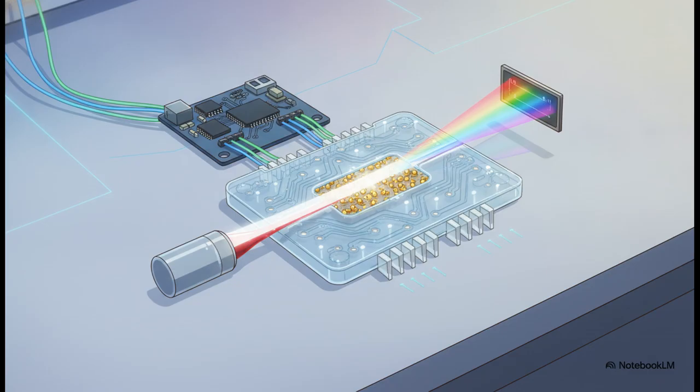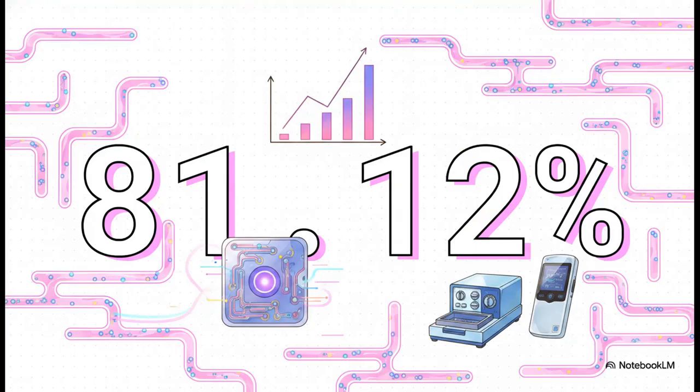Honestly, eliminating that dilution step solves a huge logistical hurdle in rapid point-of-care testing. When rigorously tested, this specific microfluidic prototype achieved an impressive recovery percentage of 81.12%. But even better, it had a tiny variation coefficient of just 0.791%. That means its results are incredibly consistent and reliable. This isn't just some fun science project. This data proves that affordable, miniaturized, polymer-based tech can genuinely rival those traditional expensive laboratory kits when it comes to stability and reproducibility.